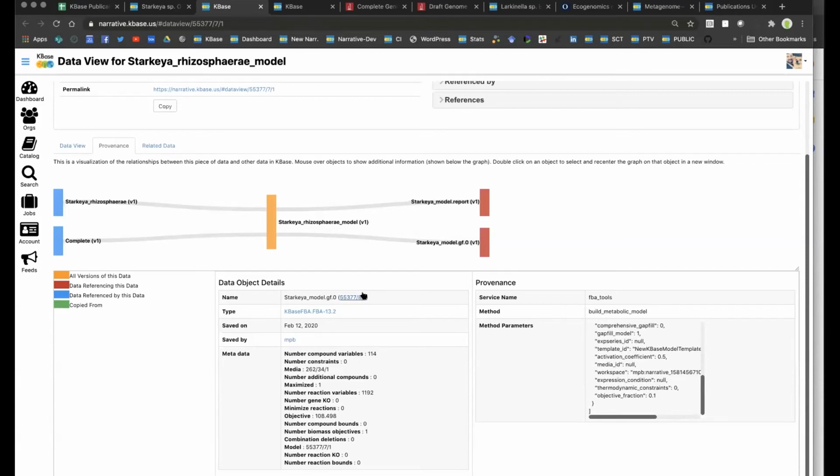And I say that because genomics and computational biology is everything is a moving target. The tools are developing all the time. The reference databases are changing all the time. How those things communicate together is changing all the time.